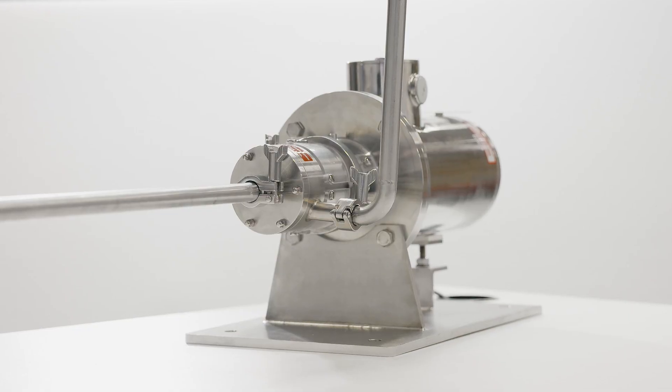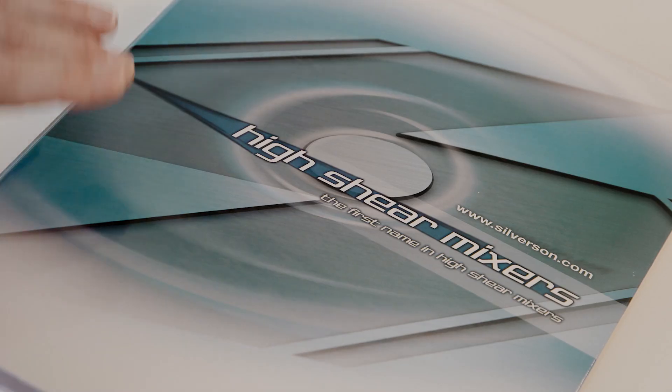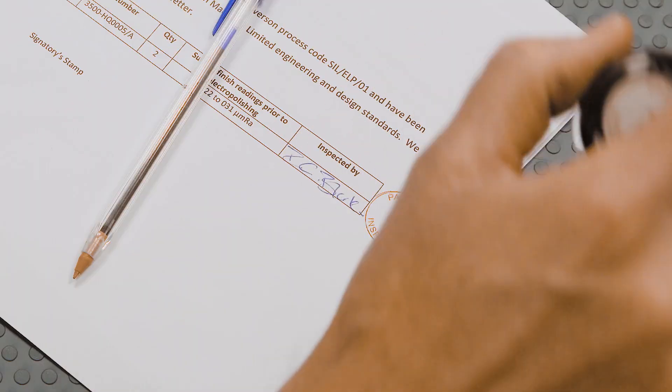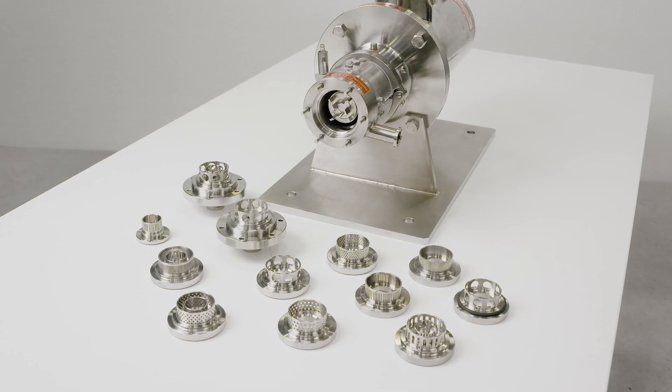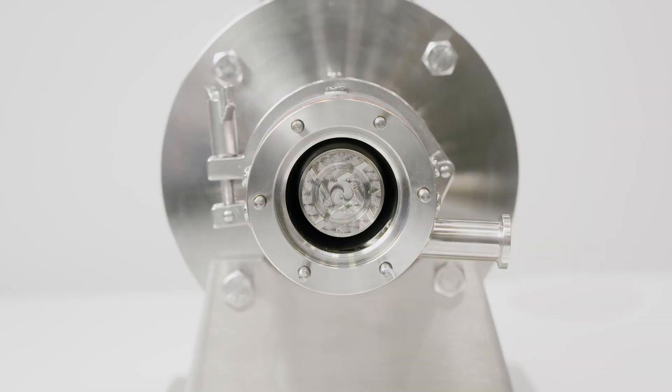As with all Silverson UHS models, the mixer can be supplied with data dossier and documentation packages conforming to all regulatory standards. The new 088150UHS offers multi-stage workhead configurations.